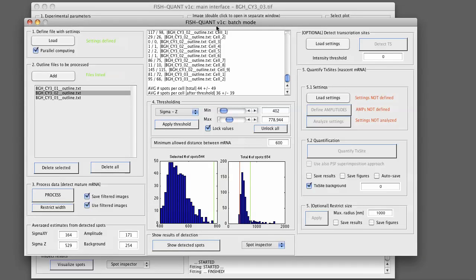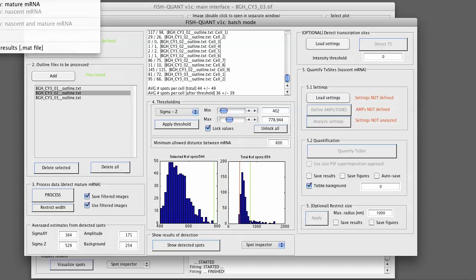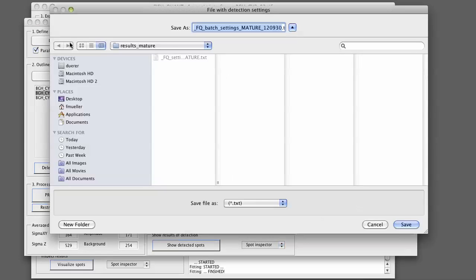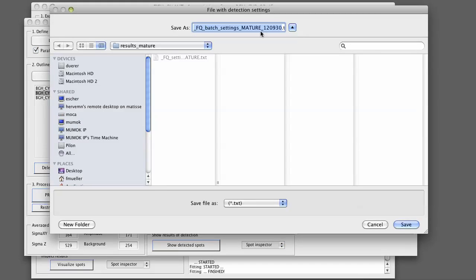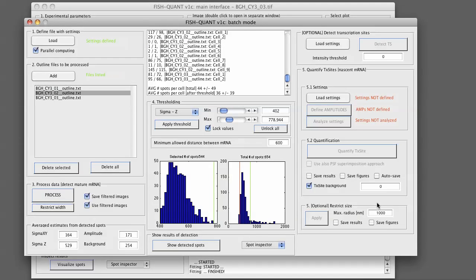What you can do now is you can save those results. The various options at the FishQuant batch save. You can save the settings. They will be saved in the results folder. This now also contains the values for the thresholding.